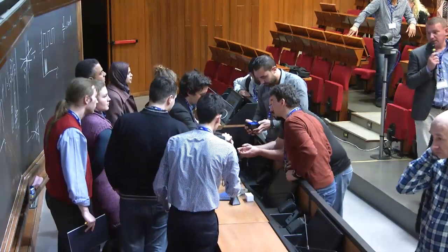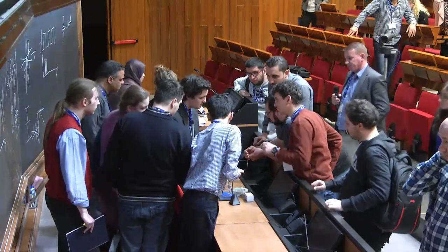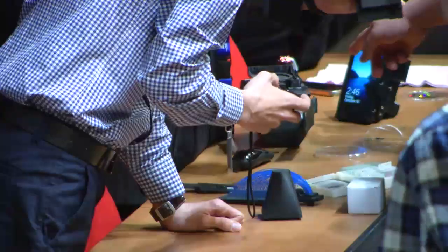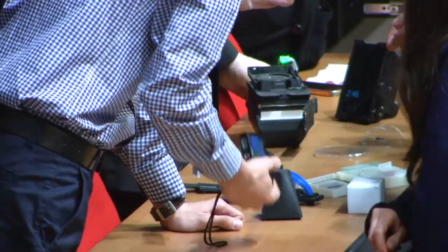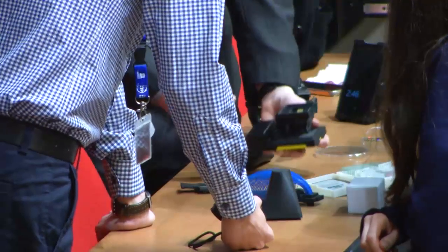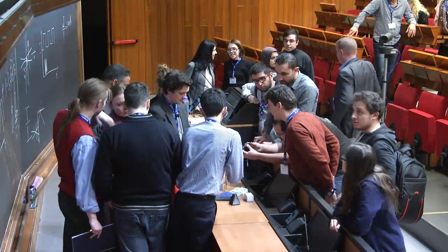Please come here. So here, this is the cartridge, where you put the sample, and here are the excitation filters. Look here and be ready, let me show you. To MLab for experiment.